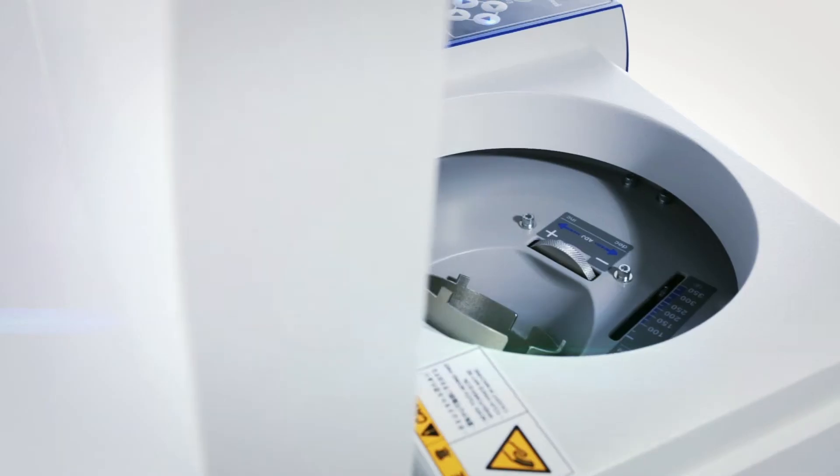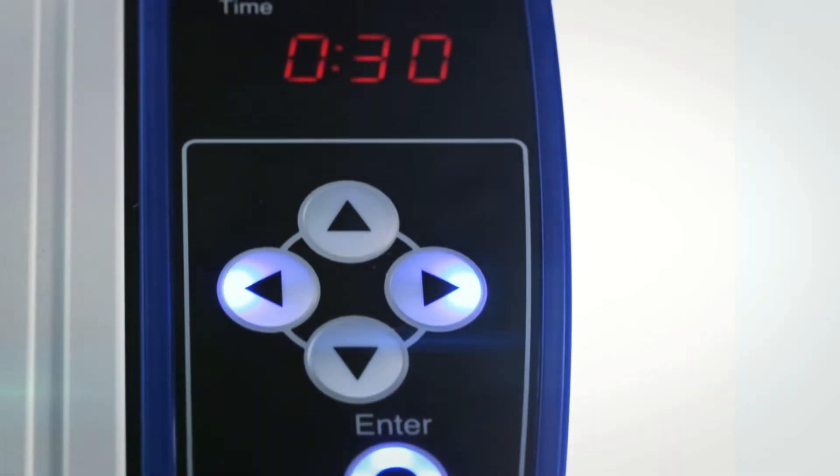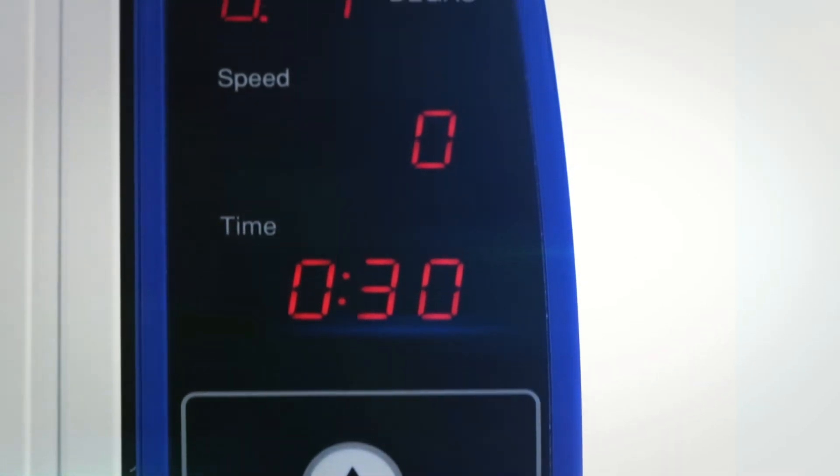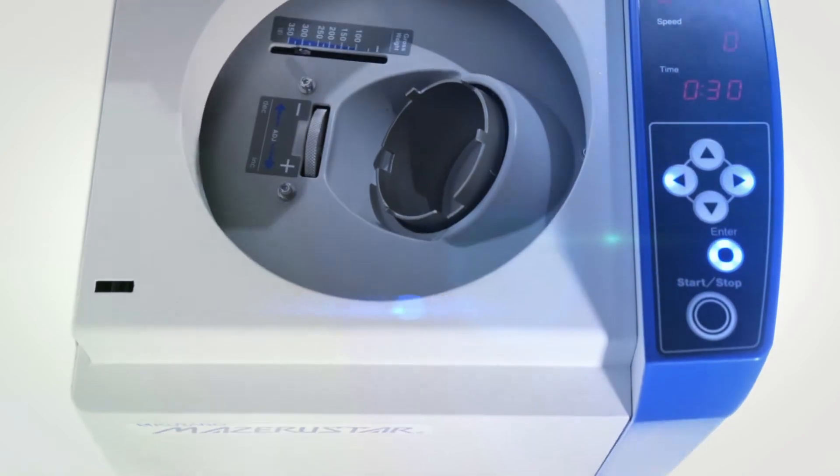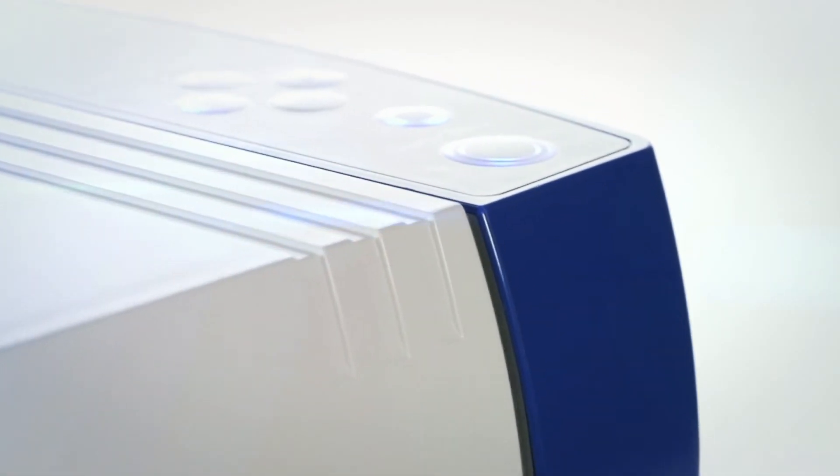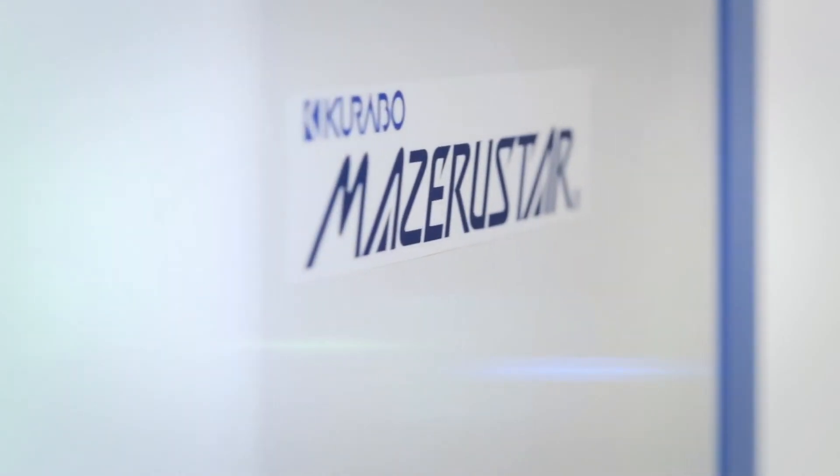Combining the need for both speed and content uniformity, Medisca is the first to repurpose and optimize a planetary mixer for the pharmaceutical compounding industry through rigorous testing and ongoing studies.